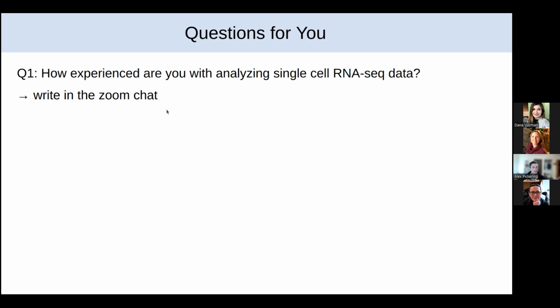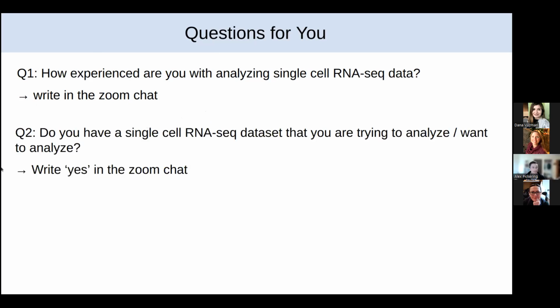Great, and I can see that a lot of you are already writing that in, which is super helpful. My next question for all of you is do you have a single-cell RNA-seq data set that you're either trying to analyze right now or that you would like to analyze?